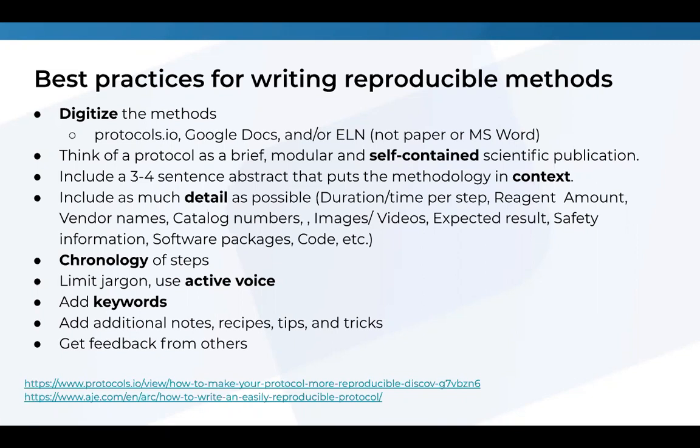And you can give them the method, or you can give them the protocol, and you can ask them if they will be able to follow this method with all the given information. So this is really a good way to get feedback, to see if others would be able to understand, and you might get really good feedback from that, and people will tell you, oh, I don't understand this step, and then it will help you to add more detail. So try to get feedback from others.